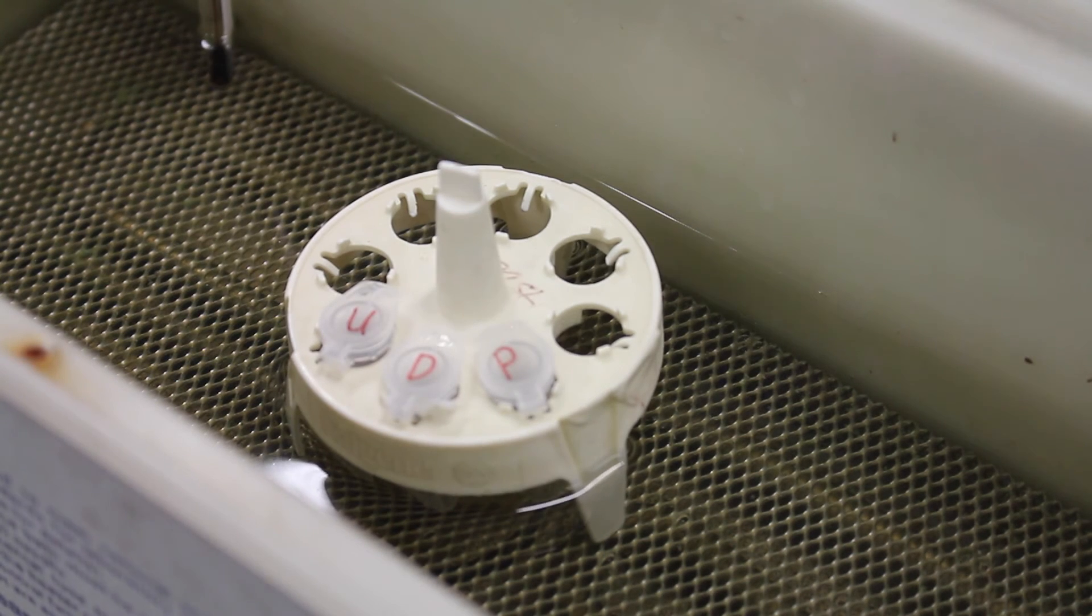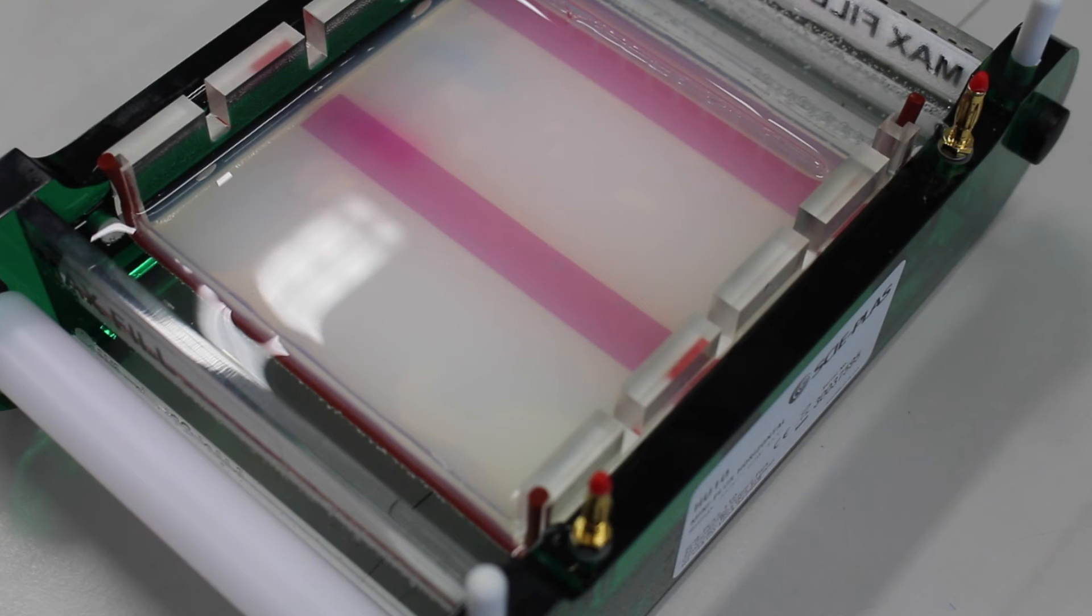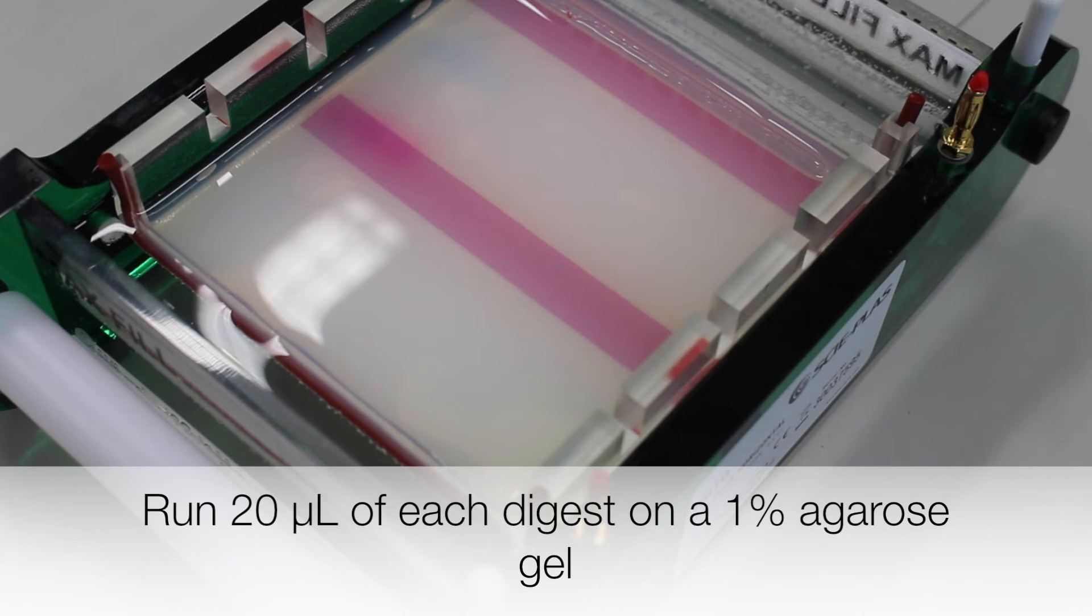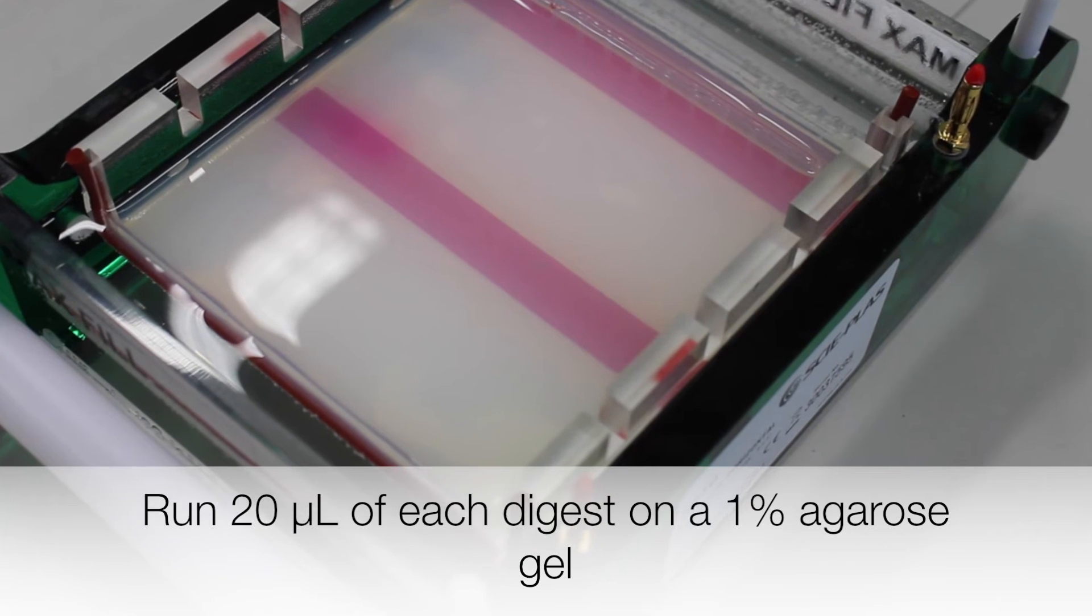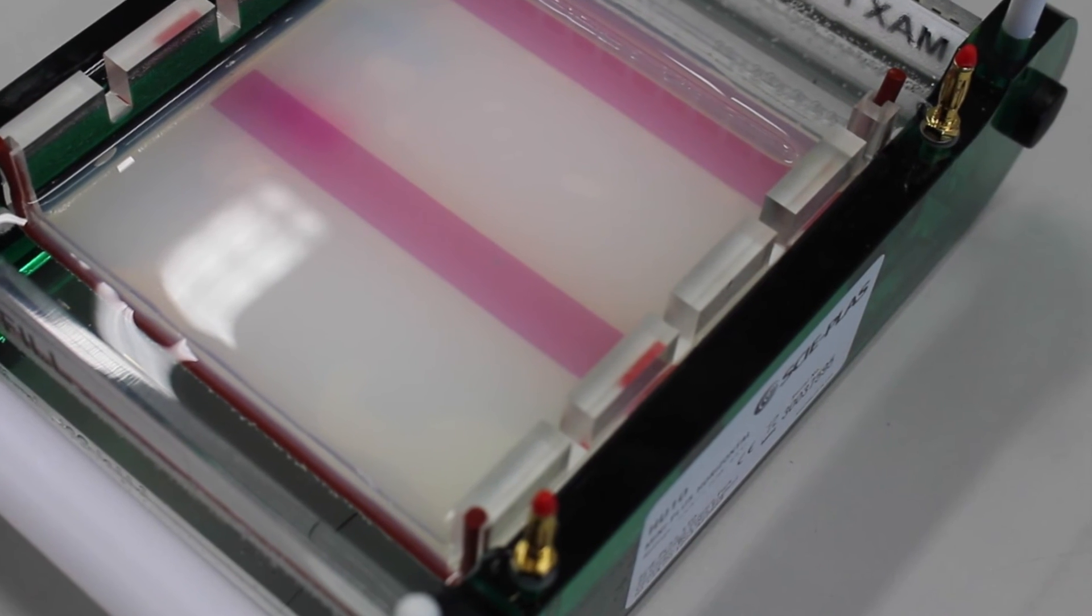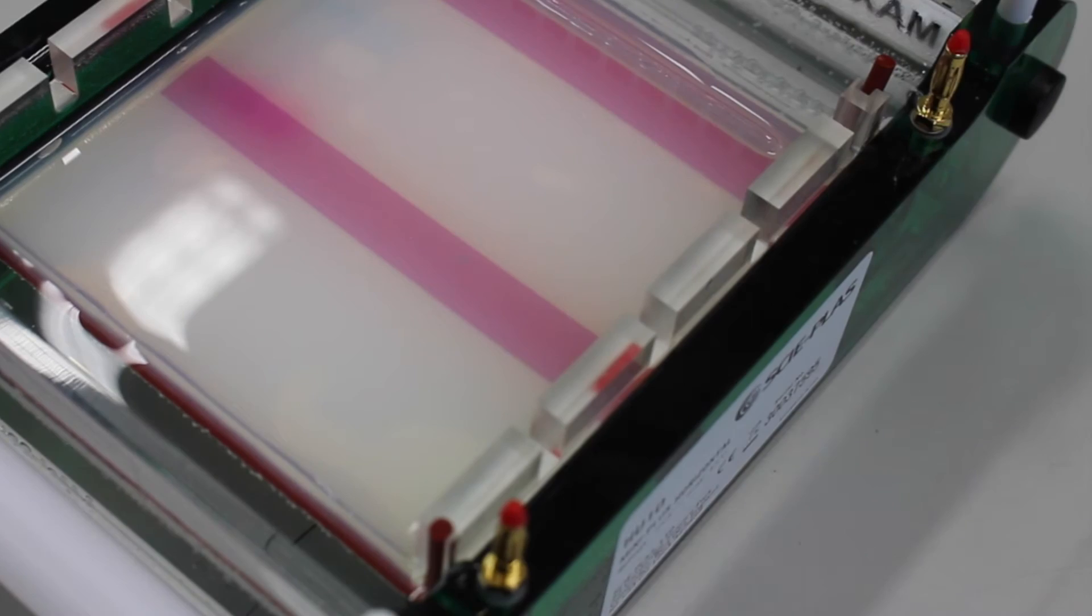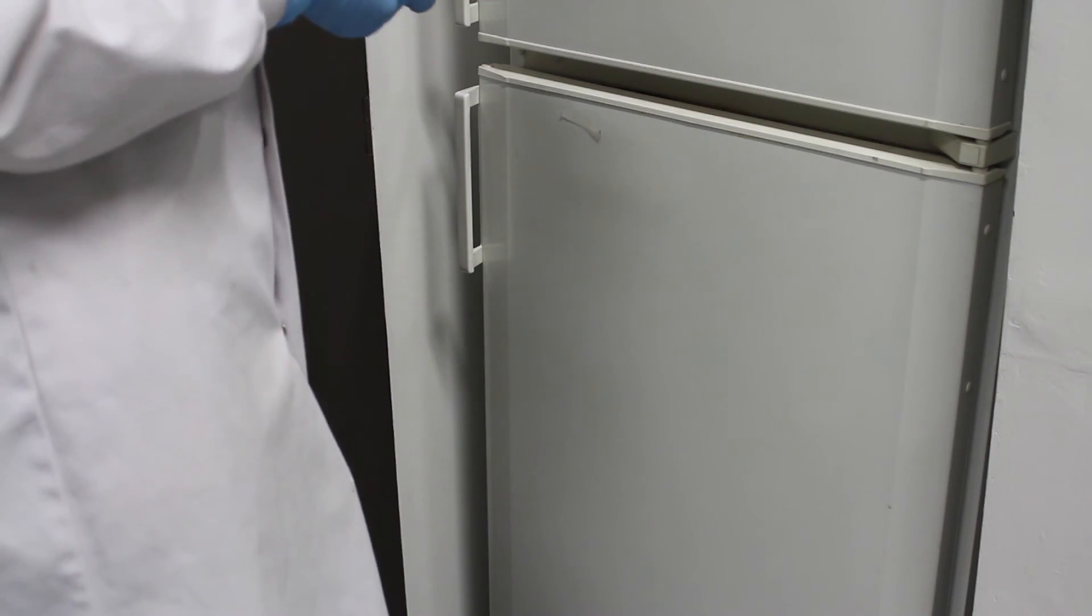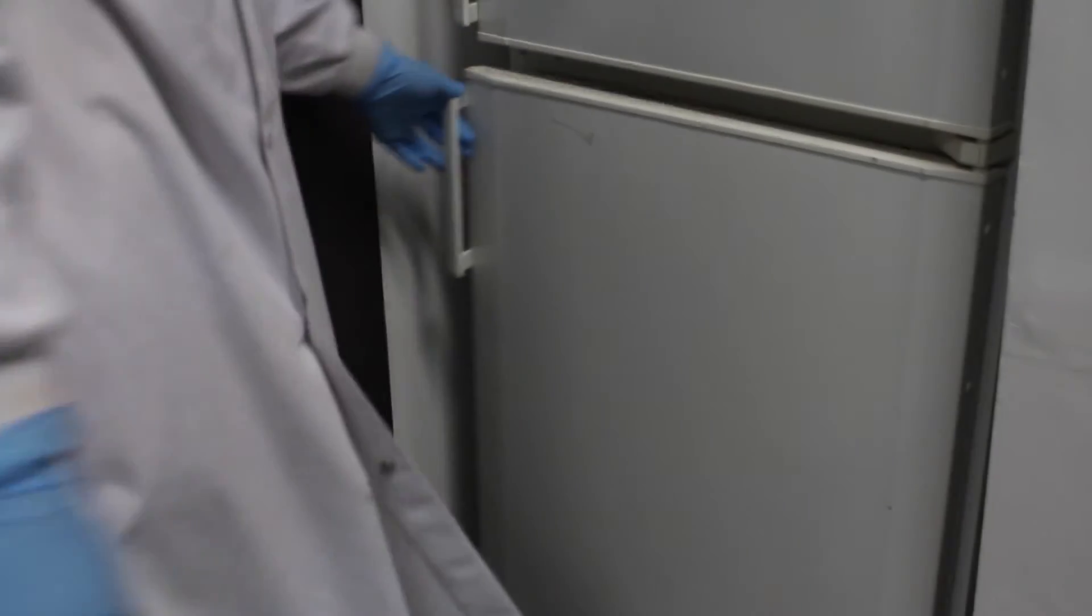From now on, the contents of the tubes are referred to as digests. To see if the digests worked, 2 microliters of each sample can be run on 1% agarose gel. If the digests have worked, the gel will show bands of expected lengths. Please click on the link provided to see how to prepare an agarose gel. The plasmids can then be stored at minus 20 degrees Celsius, or you can proceed directly to the ligation step.